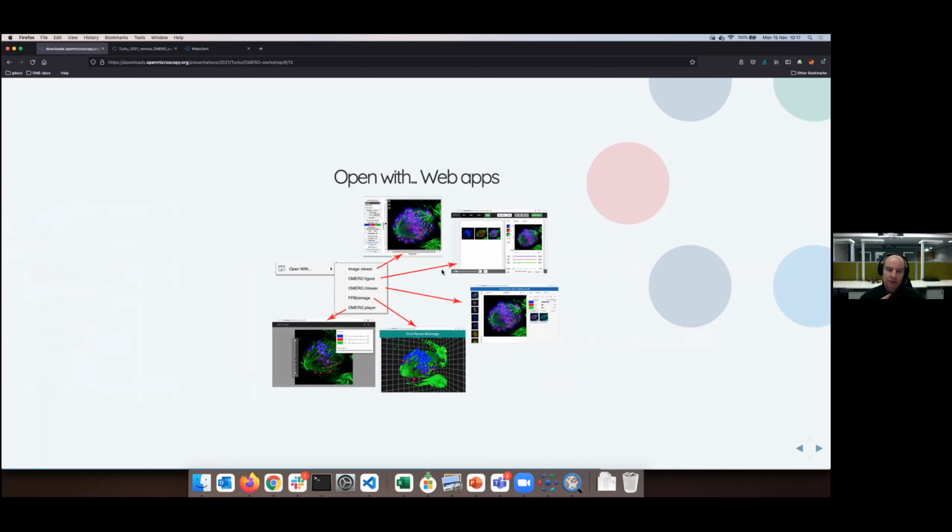Then on Omero Web, we have an environment. So once more, Omero Web is the main so-called client. That's what will be for us in this workshop, bread and butter. We will be in Omero Web day in, day out, and we use it as a reference to view everything in the most convenient way inside Omero.